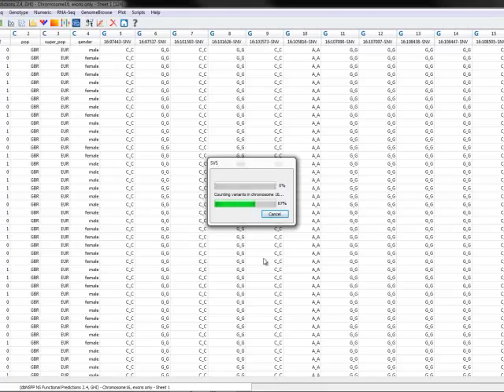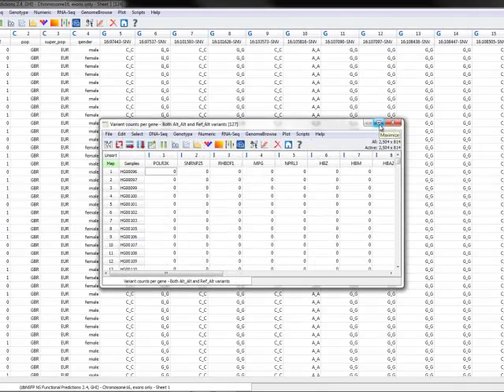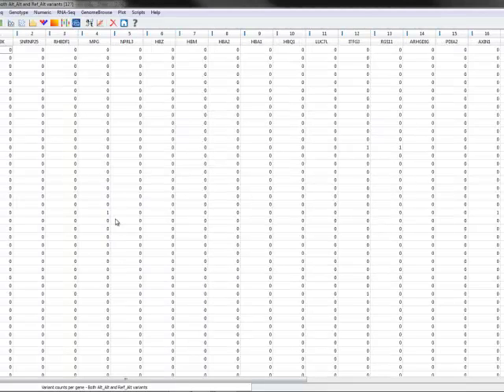Within those columns, we'll have numbers representing how many variant sites were identified in each sample within the gene based on this filtering process that we used. So we'll give it just a moment. So here's our output. With this sort of information now, we see most of the data is simply zeros. We have rare variants. We don't expect a lot of big numbers in here. But we do occasionally see some counts where we recognize, okay, a few samples have some variants in these genes.